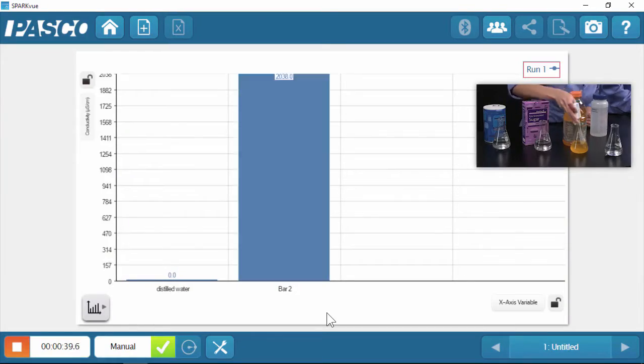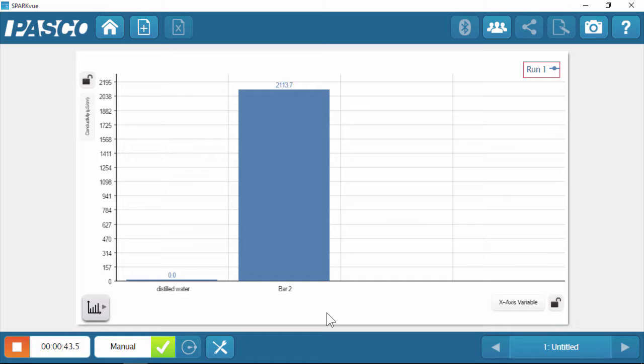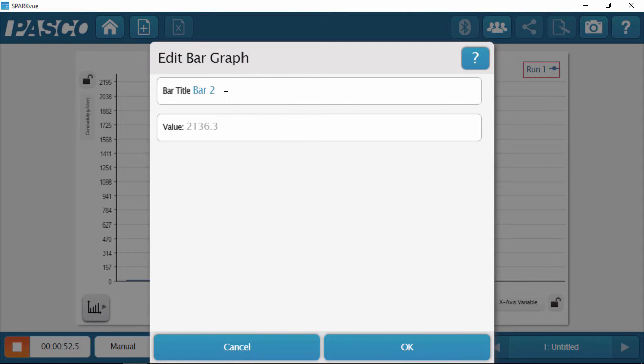I'm going to rinse the sensor, because it's good to rinse with distilled water in between samples. Then we're going to measure the conductivity of sports drink — I hear there are electrolytes in them, let's find out what electrolytes are. Here's the conductivity of that sports drink. Wow, that is a big jump — that's over 2,000. I'm going to hit keep in the software, rename that bar sports drink, and then get our next sample ready.